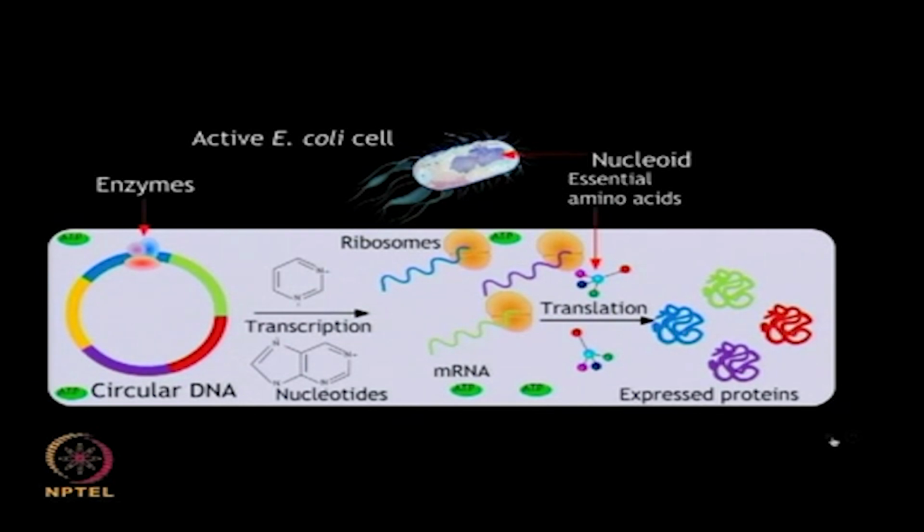The cofactors and enzymes such as RNA polymerase, peptidyl transferase are available in significant quantities due to the cellular process of transcription and translation taking place in the cell. As you can see in the animation, the two steps have occurred here, the transcription and translation, and the required material have been provided exogenously.